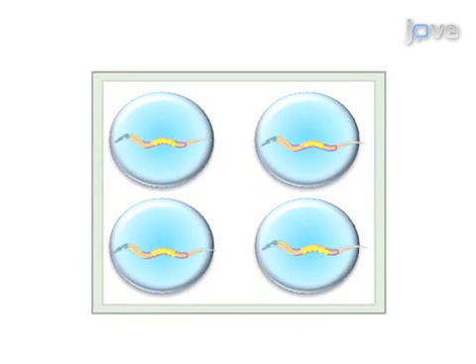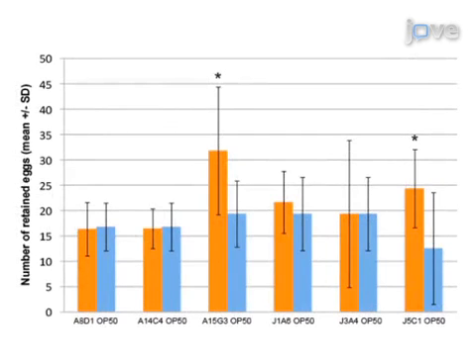Next, worms are bleached to dissolve the outer cuticle and expose the eggs. The number of eggs that were retained within the uterus are then counted. Results are obtained that show the number of eggs retained varies based on the different types of bacteria fed to the worms.